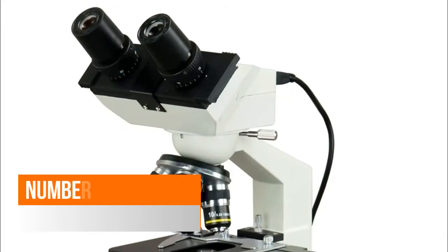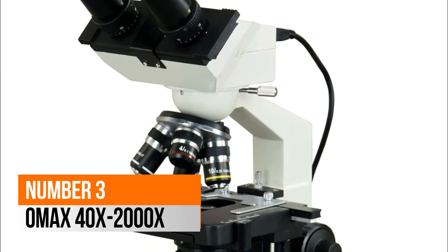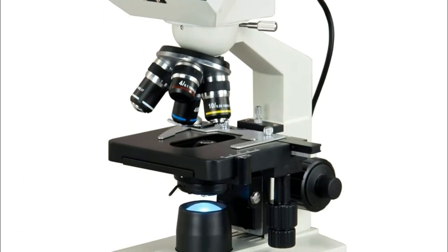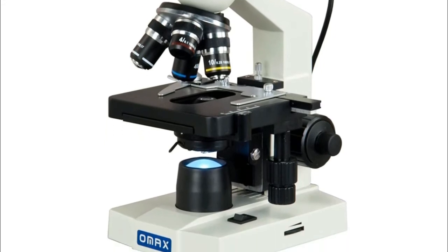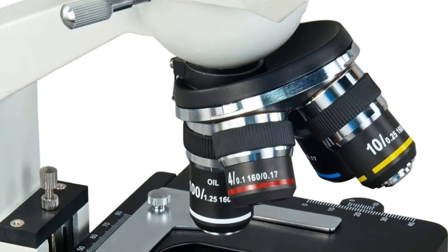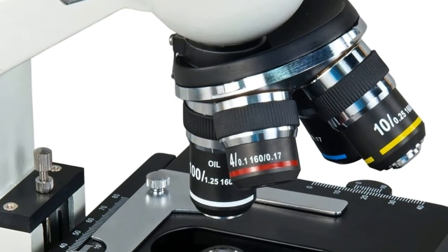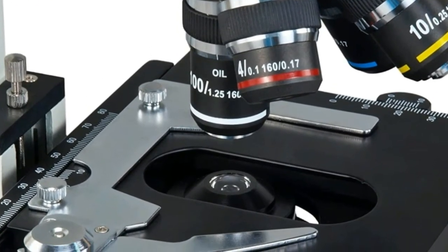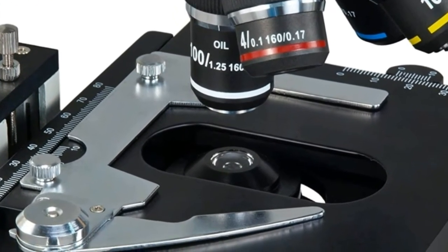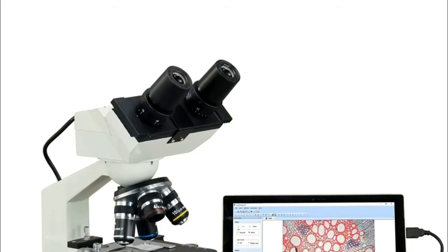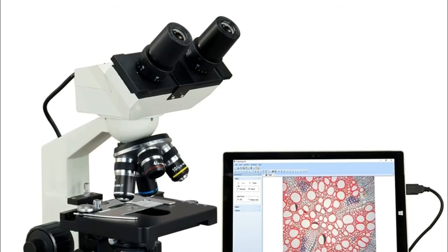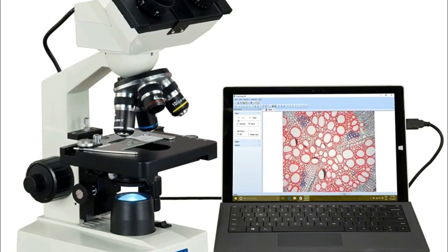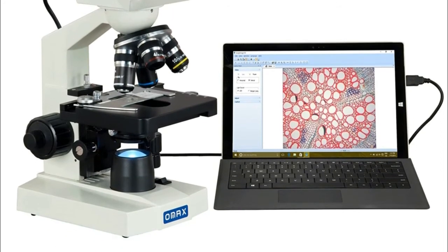Number 3: OMAX 40x–2000x. High quality professional optical glass elements. 45-degree inclined, 360-degree swiveling binocular. Sliding interpupillary distance adjustment. Ocular diopter adjustable on both eye tubes. Variable intensity illumination. Coaxial coarse and fine focus adjustment, with focusing knobs on both sides.